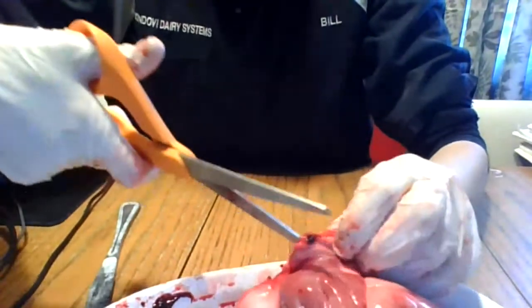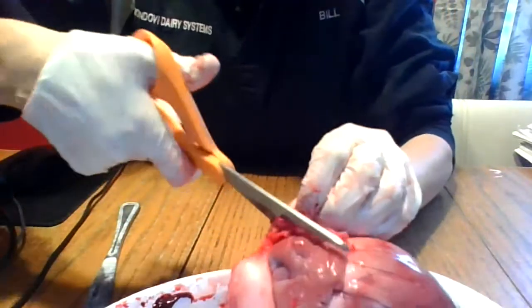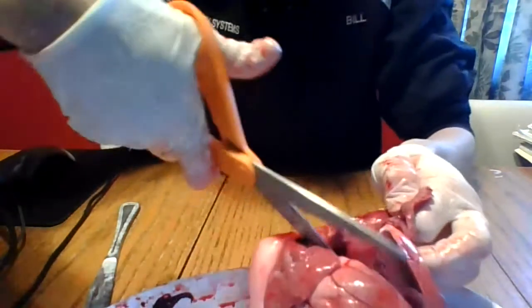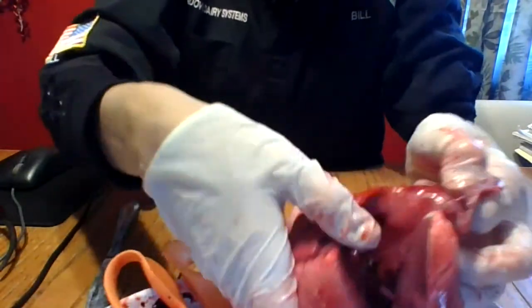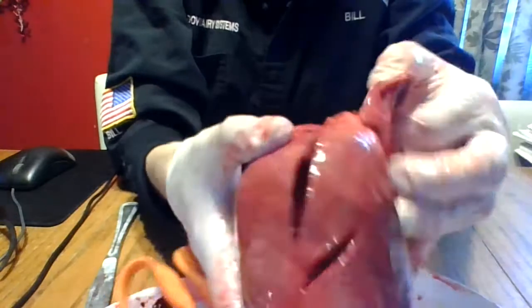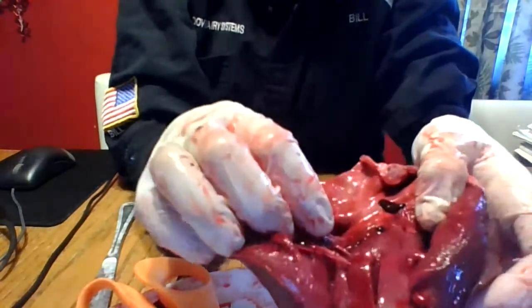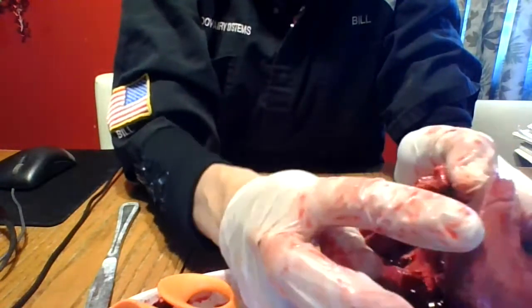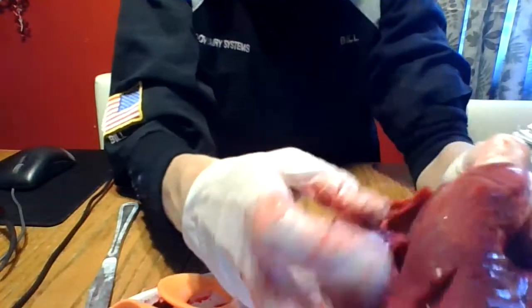Now we're going to cut the left side. I'm going to cut into the pulmonary veins — because veins go toward the heart — which go into the left atrium. Look how thick that myocardium is! Does anybody remember why the left ventricle myocardium is so much thicker? This is the right ventricle, and this is the left ventricle — that's like three times as thick. Does anybody remember why that's thicker?